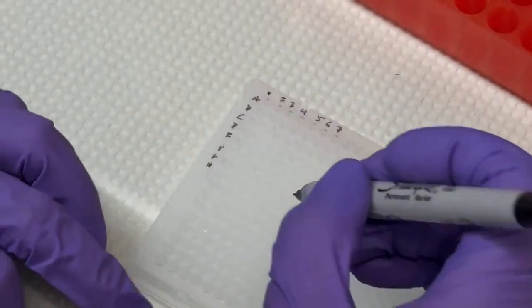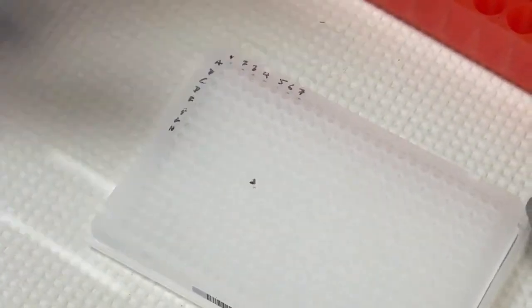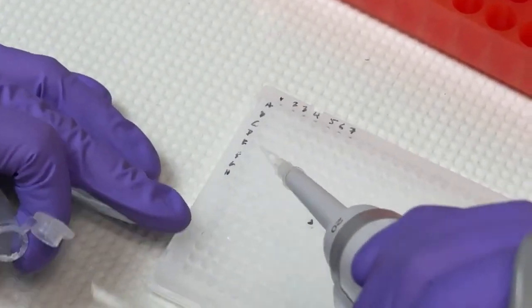I'm even going to mark the edge here. Okay, so that's our field of view. So we did A1 through 3, C1 through 3, E1 through 3 with our master mix.